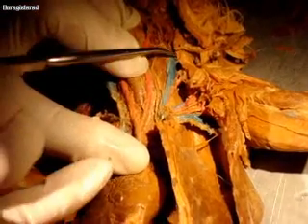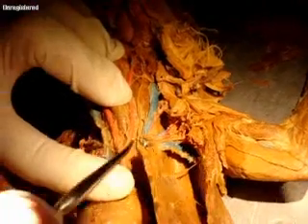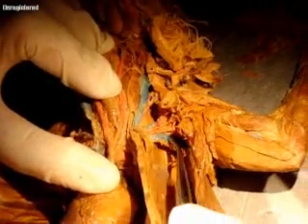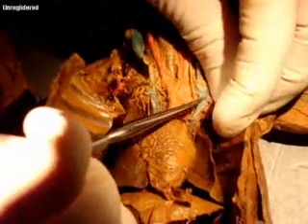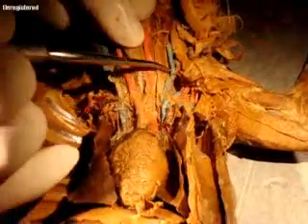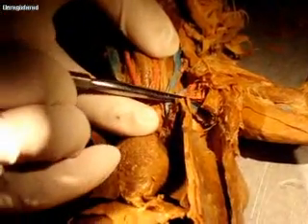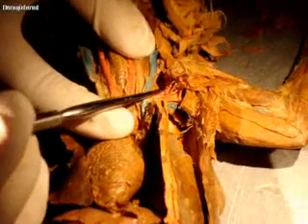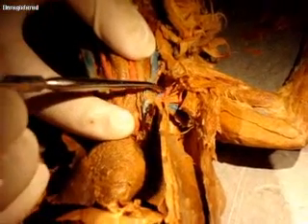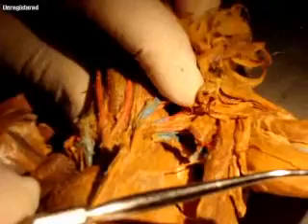This is the left cranial vena cava. This is the left external jugular. Here's the left cranial vena cava, and this is the left external jugular. In between them is the left subclavian. And this one coming out this way is the left subscapular. Those are all the veins on that side that you need to know.